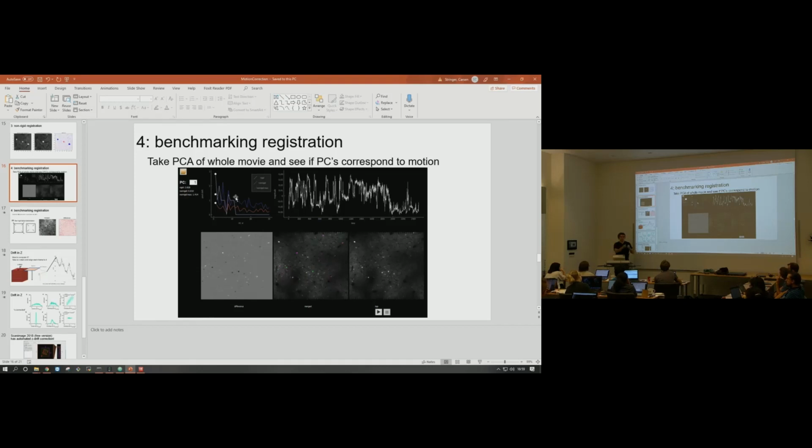So if you do your visual stimulus SNR metric, like how peaky your tuning curves are, or how reproducible your responses are between 2 repetitions, those are measures of SNR, and because you've added this extra noise, they'll be lower than if you deconvolve, and localize the entire part of the calcium corresponding to a single stimulus to just that bin and not the nearby bins.